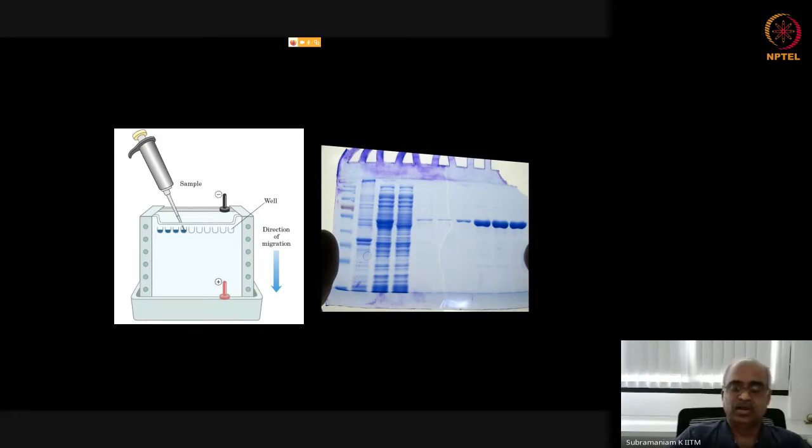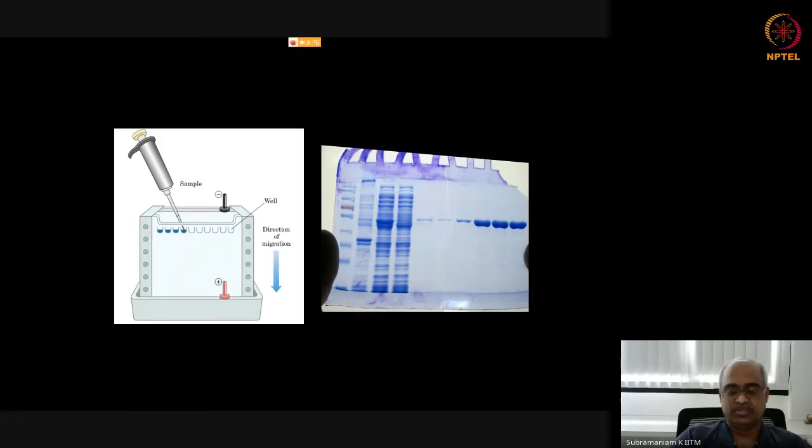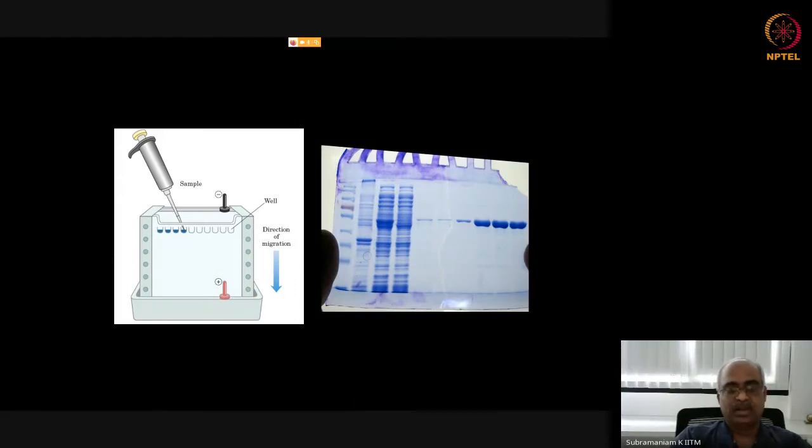So now when you allow it to cool, it slowly becomes a gel. It solidifies and becomes a uniform gel. So what we do is, after melting, we pour it onto an acrylic sheet based tray, and in the tray it solidifies and you make the gel. So the shape of the gel depends on the shape of the tray. Usually it's a rectangular boat-like structure with the shorter dimension open.